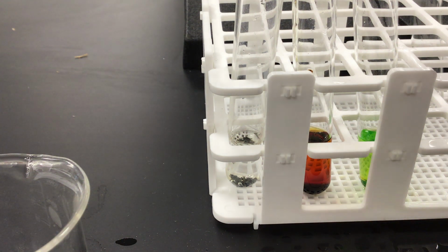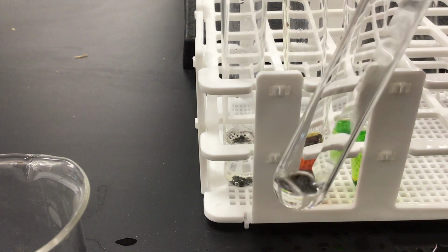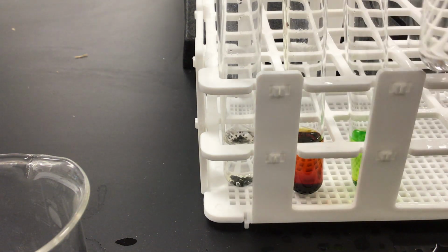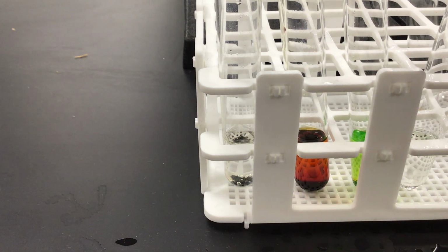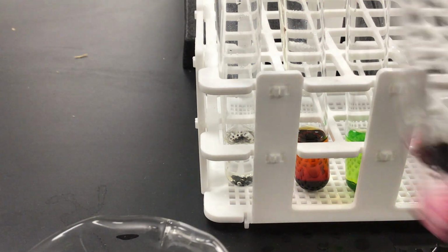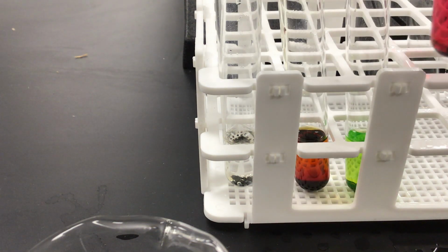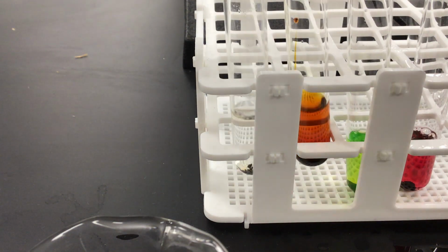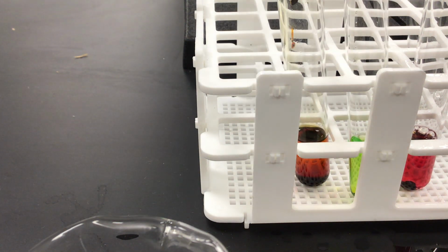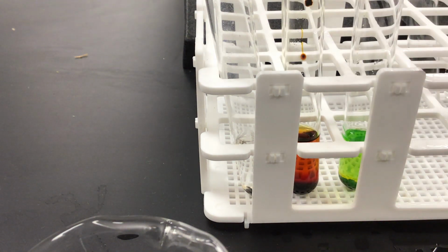Kerosene. And when I add it to the kerosene, it turns a purple color. So obviously, if it's turning a color, they are mixing. So water, no color change. Ethanol, color change. Ethylene glycol, nothing. Kerosene.